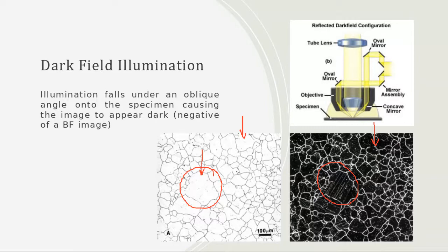Whereas in dark field, they show up really nice. And you can tell, oh, I have twin boundaries within this grain. Oh, I have twin boundaries in this grain. So you could start going through and picking out some of these twin boundaries. There's a small area of twin boundaries here. So now you can start seeing twin boundaries. Whereas if you were to look at this image on the left for the first time, you wouldn't realize that you should have twin boundaries.